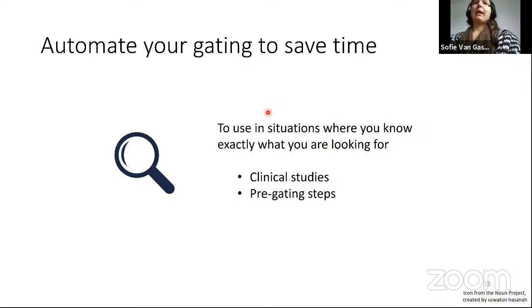One way you might consider this is just to automate your gating. So you have done a manual gating before, and you say, okay, now I have to do this for my 3,000 other samples. You could do it by hand, but it will be very annoying. So you might consider maybe I can use a computational tool for this instead.